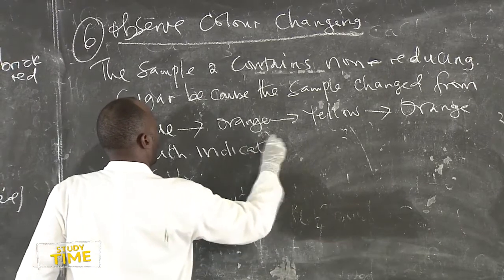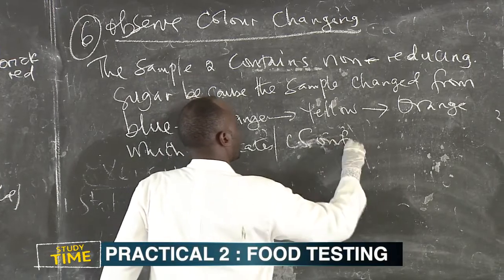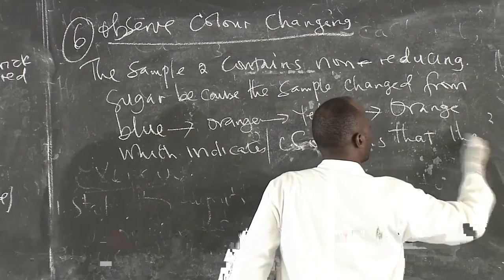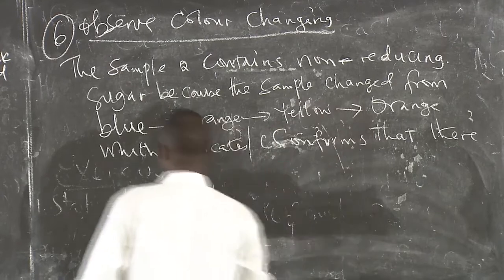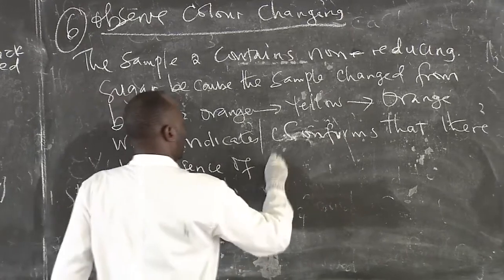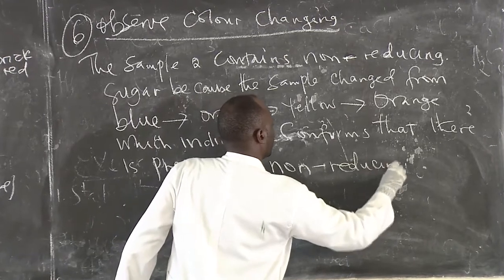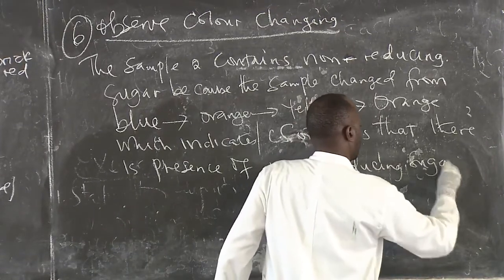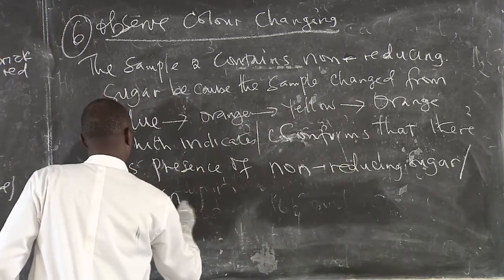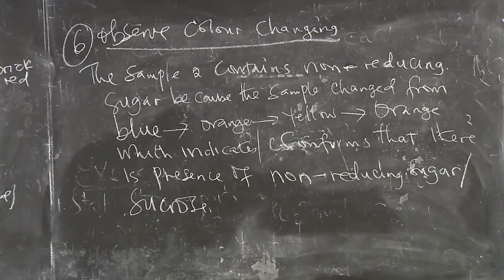or which confirms that there is presence of non-reducing sugar. Or we can say there's presence of sucrose. So I think that is the sample we had to do today.